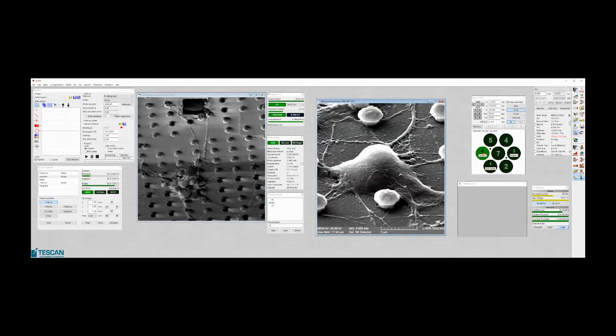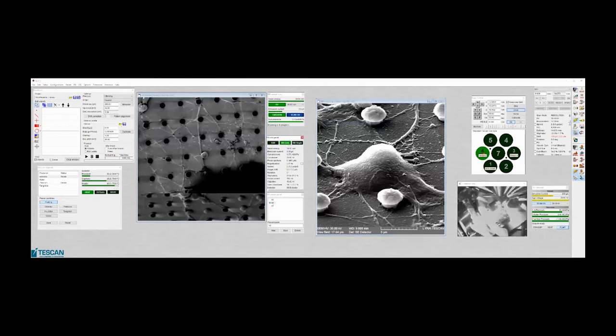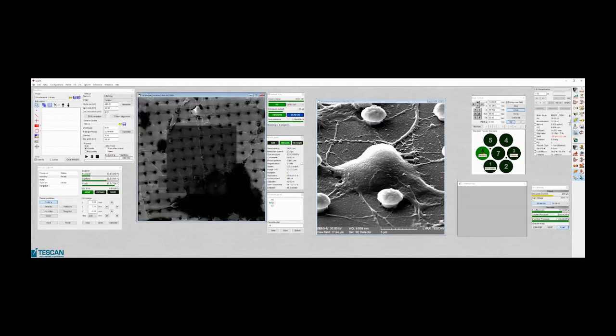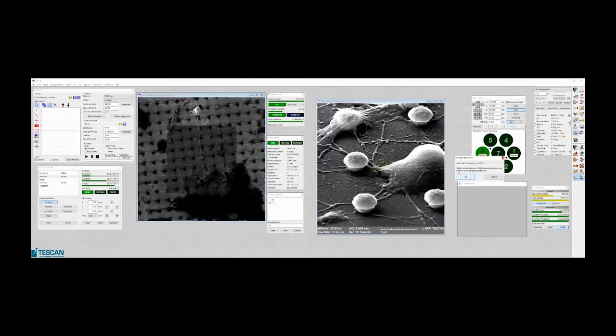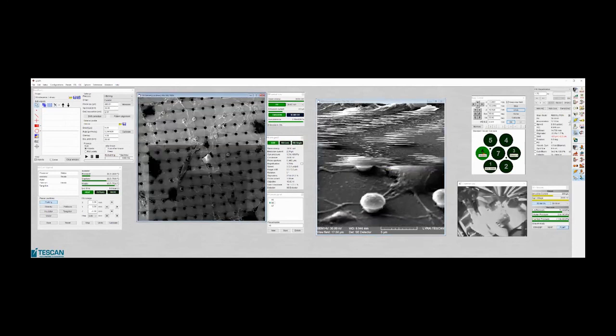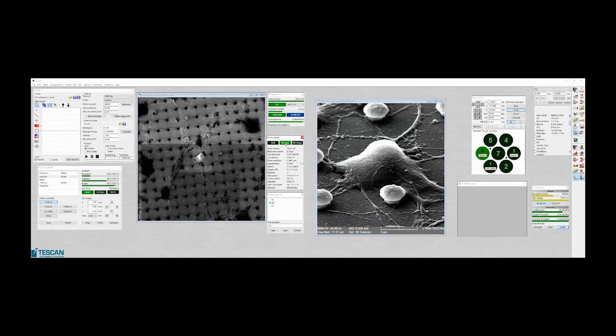Okay. So you can run, where we are. Okay, this one is it. So you can do tomography.